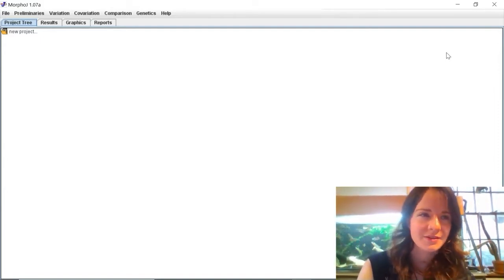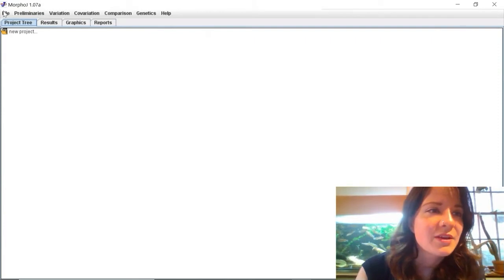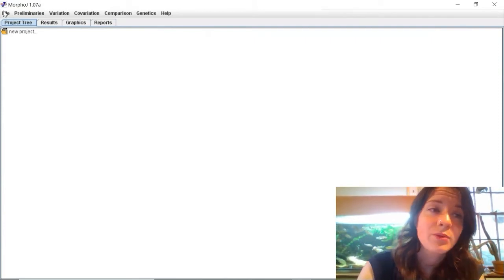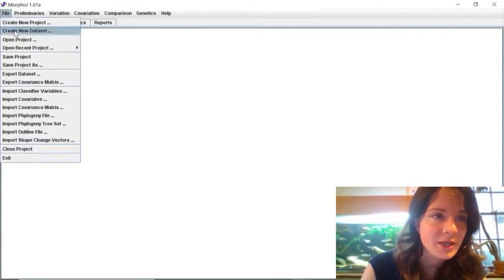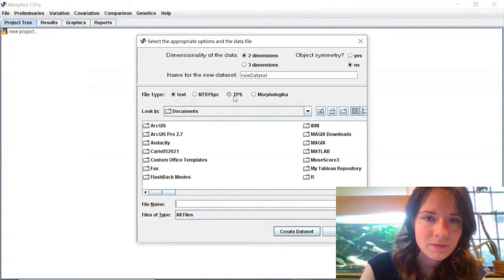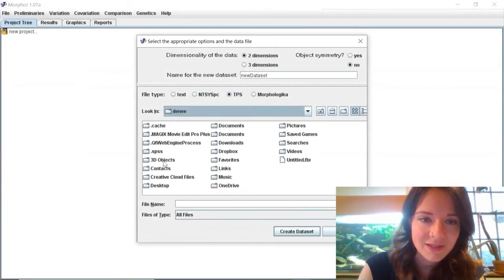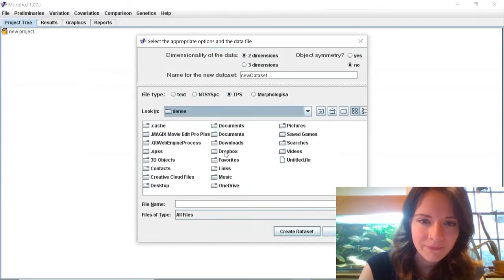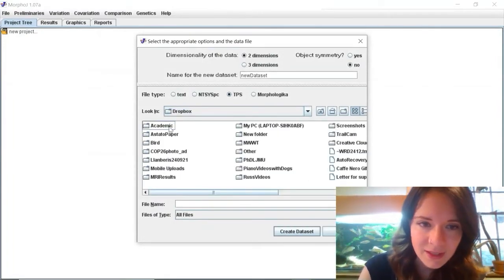So the first problem is you're trying to import your data set into MorphoJ. I've just got an example dataset here.